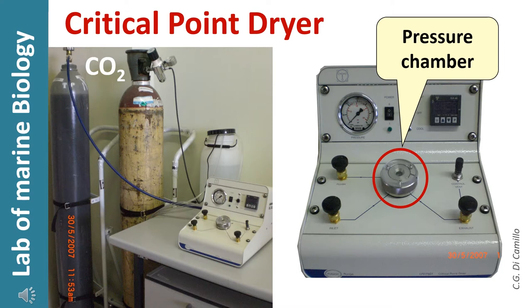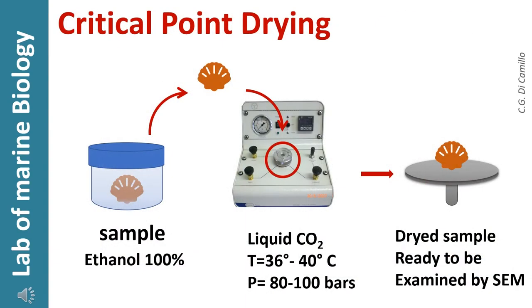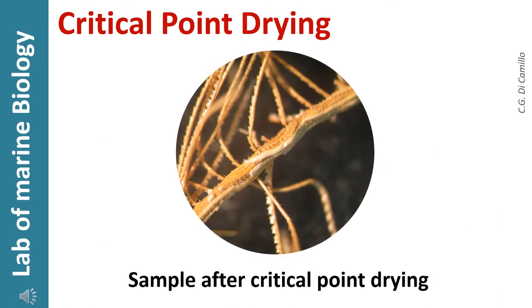At a low temperature of 5 degrees Celsius, liquid CO2 will be transferred by a cylinder to the chamber. Then, the chamber is heated until a critical value of temperature, which is about 36 degrees Celsius. At this temperature, and a pressure of about 80 bars, the CO2 will change phase from liquid to gaseous. A sample after CPD appears exactly as it was in water, and it does not collapse.